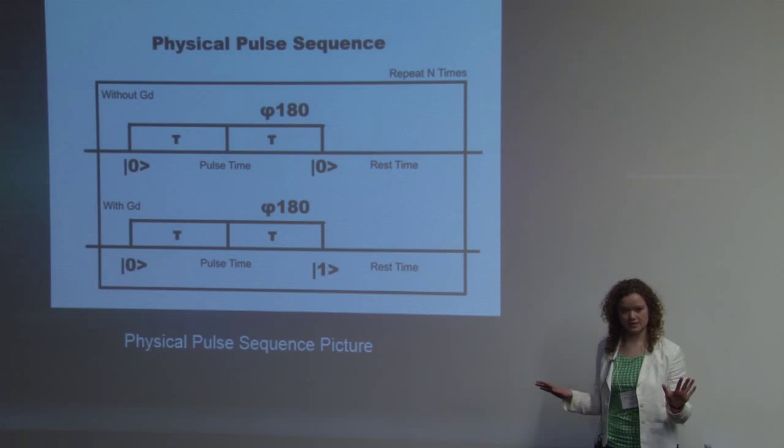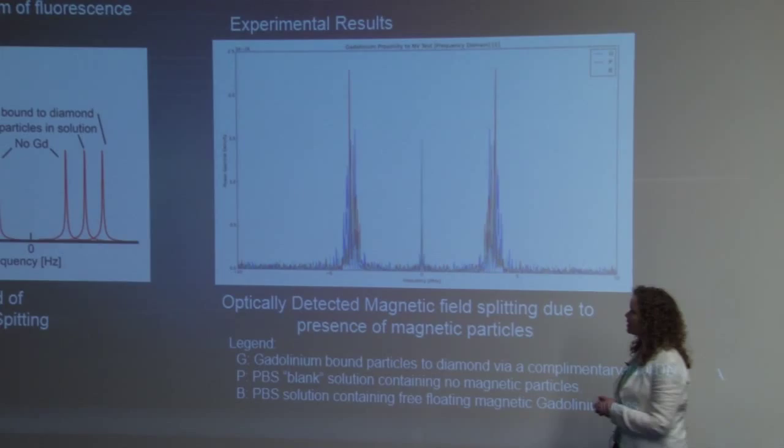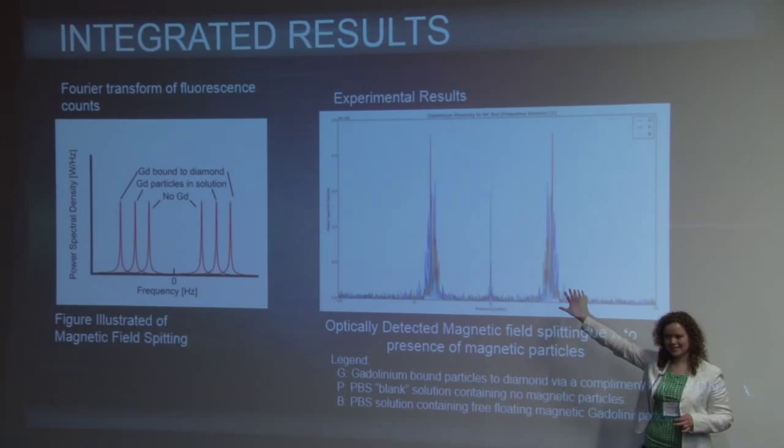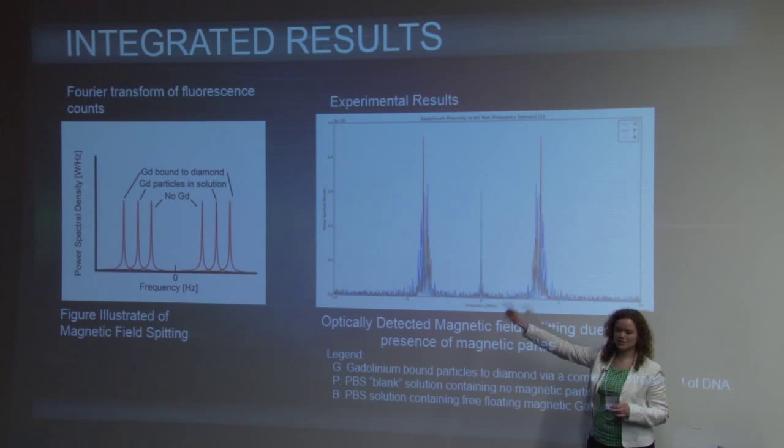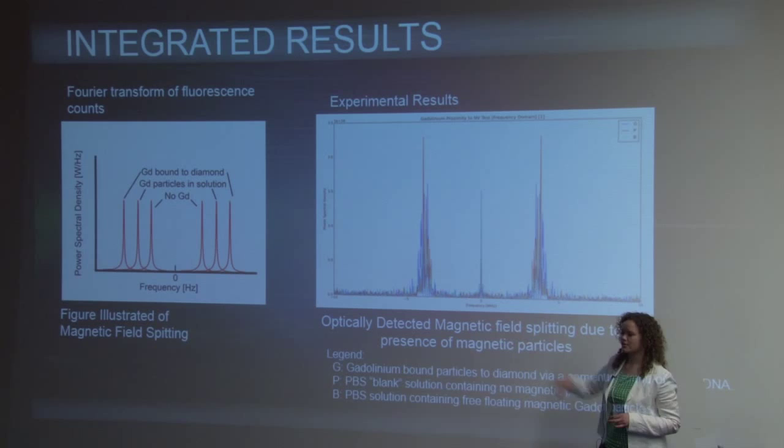So this is actually what our results have shown. On the right-hand side are our experimental results, and it's quite difficult to see our shift because we're dealing with concentrations that are so small. It's very difficult to see with an untrained eye, which is why we've created this illustration on the left-hand side. I'll be explaining our results using our illustration. So I'm just going to walk over here.